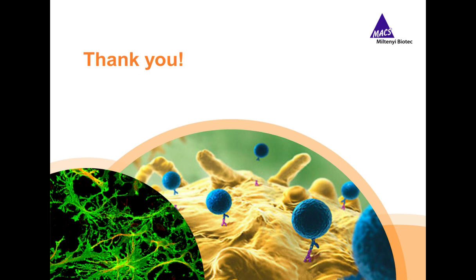Human brain is very, very difficult to dissociate, and our GLAST antibody is not compatible with the adult brain dissociation kit, as this kit includes papain, and the GLAST epitope is sensitive to papain, and therefore we have to use a trypsin-based dissociation. We do not recommend using a trypsin-based dissociation for human brain, as this is really difficult to dissociate. Therefore, we cannot recommend using the anti-GLAST antibody for isolation of human astrocytes. But that's not a question of the antibody, it's more a question of the dissociation, which is really, really difficult in case of human brain.